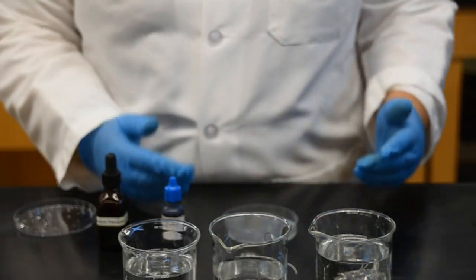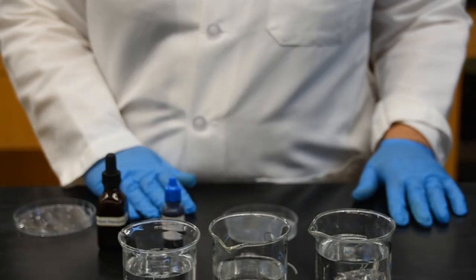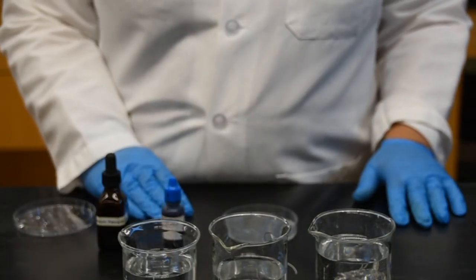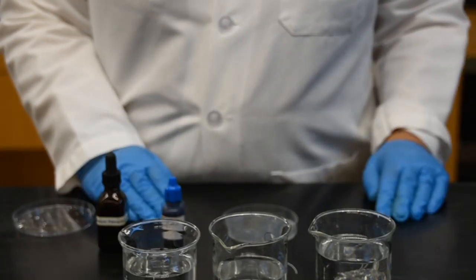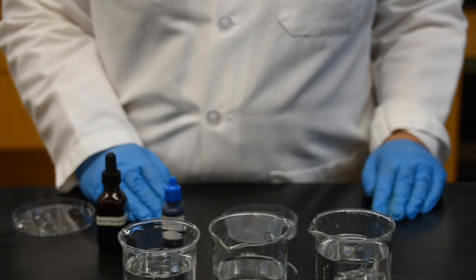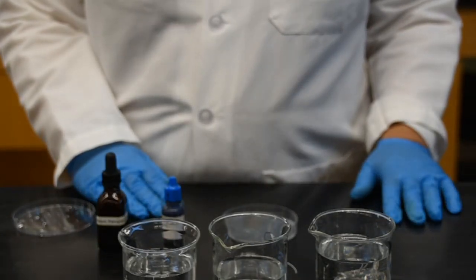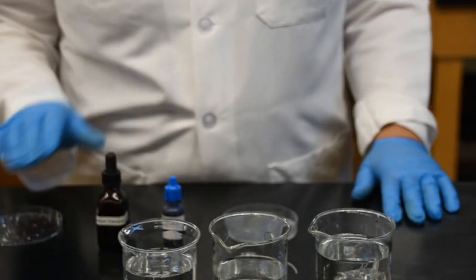Now what our goal is, what we expect to see, or what our prediction is, whichever of these molecules are lighter or have a smaller molecular weight, they will travel a longer distance compared to the heavier molecule. So we're going to set up a small drop of each of these samples to each of the openings, and then let this sample sit for about 45 minutes.